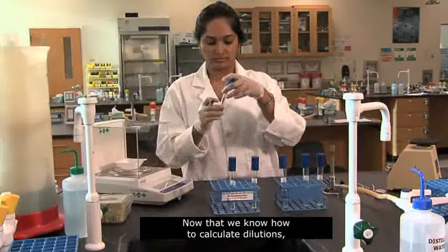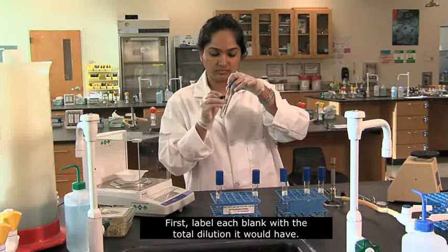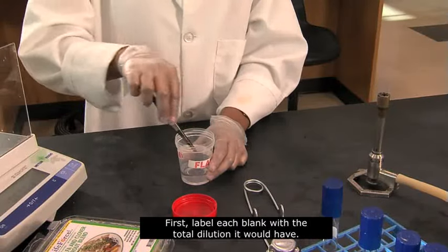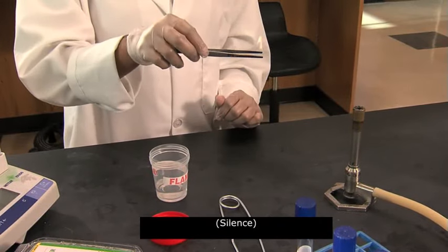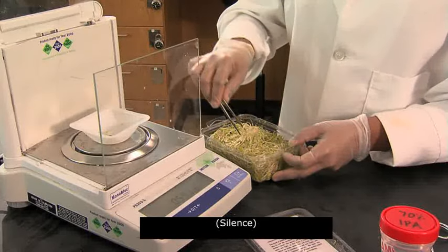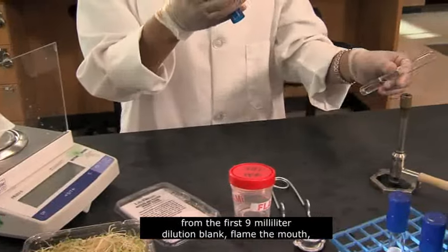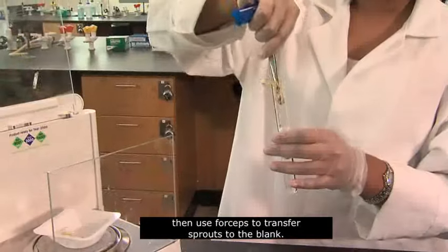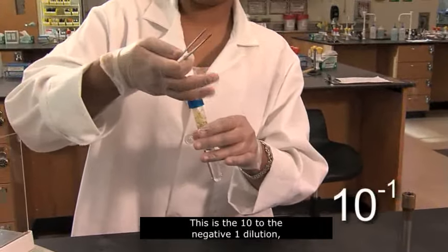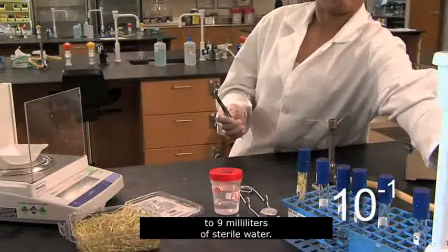Now that we know how to calculate dilutions, let's use our serial dilution method to estimate the number of bacteria on sprouts. First, label each blank with the total dilution it would have. Aseptically weigh 1 gram of sprouts. Using aseptic technique, remove the cap from the first 9 milliliter dilution blank, flame the mouth, then use forceps to transfer sprouts to the blank. Flame and recap the tube. This is the 10 to the negative 1 dilution, since we're adding 1 gram of sprouts to 9 milliliters of sterile water.